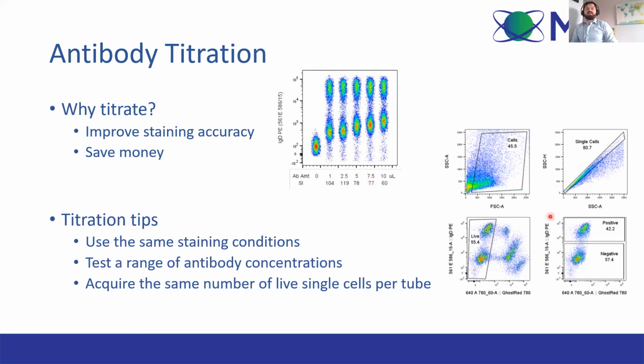So this is just a little run through a gating strategy for your cells for looking at a titration. It's an example. I couldn't find a full one that ended up like this. But what you do is you select your cells, gating out all the crud, which would be here on the left, and cell debris and things like that. You then want to gate your single cells. So you want to do side scatter area on the X versus side scatter height. Get your nice single cells, gating out all your doublets and triplets and things.